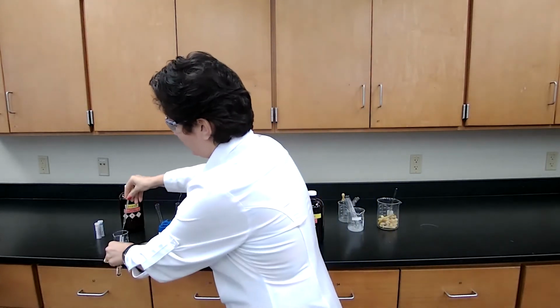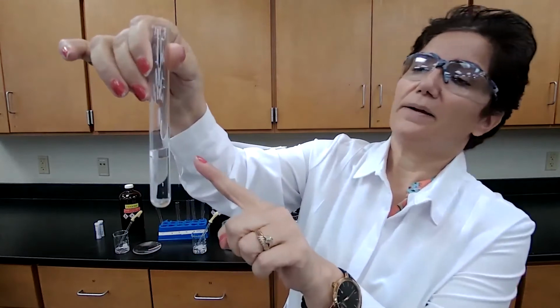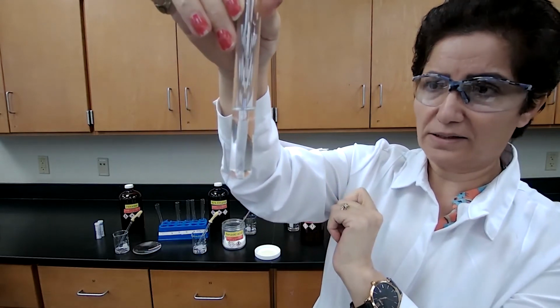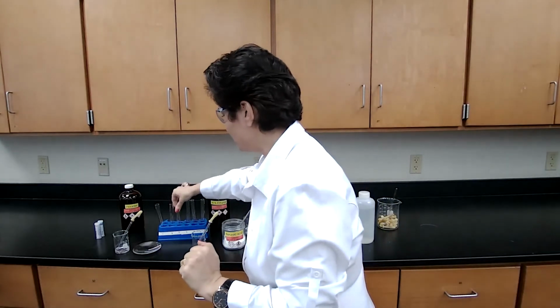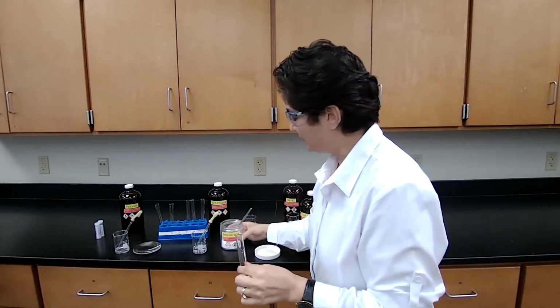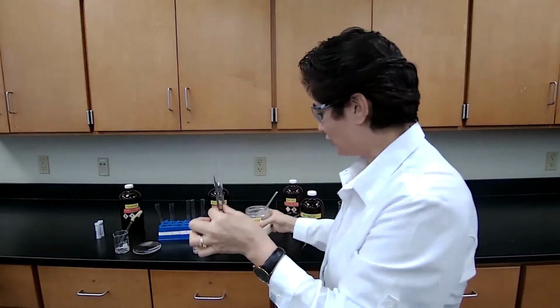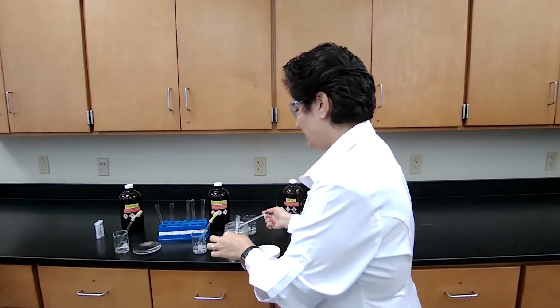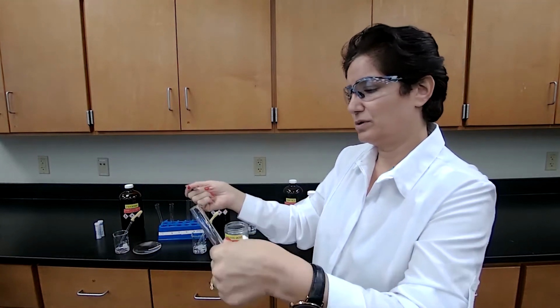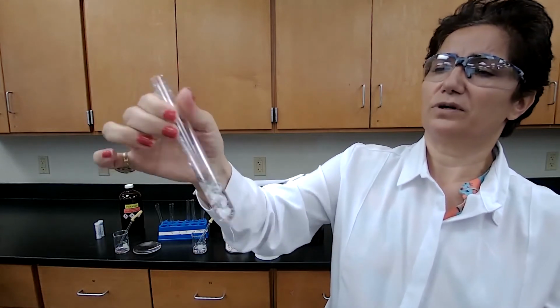Hexane did not dissolve in water, and we are going to test it in sodium hydroxide. Okay, the second layer formed here with sodium hydroxide and hexane, so it's not soluble. For the next test tube, I have sodium hydroxide. I'm going to add benzoic acid. Benzoic acid, because it is a carboxylic acid, an organic acid, and we have a strong base here, it is expected to dissolve, but I always experiment. I don't go with the expectation. And I want you to look at the reaction and see if it dissolves or not.